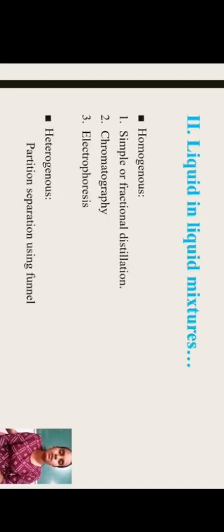In liquid mixtures, there are also two types, homogeneous and heterogeneous. Homogeneous mixtures are separated by simple or fractional distillation, chromatographic methods and electrophoresis. Heterogeneous mixtures are separated by partition using a separating funnel. The quality of the finished product is very significant in the mining industry, food processing laboratories or industries, synthetic laboratories, or in research centers.